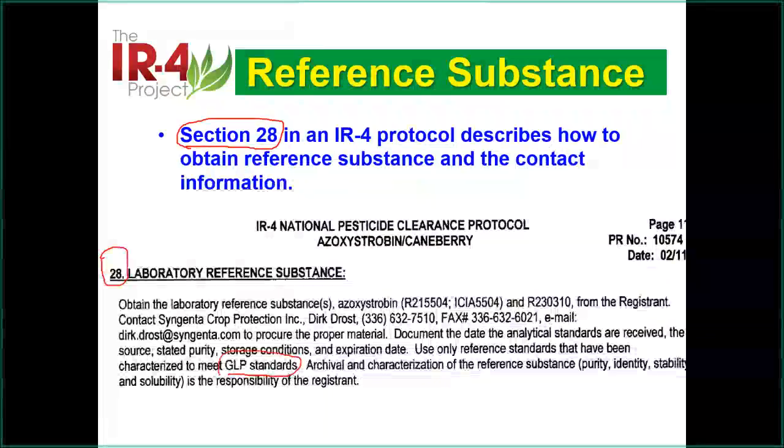If your standards are not GLP, you need to talk to the study director. Your work will not be acceptable. It depends on where your report is submitted to, but I would say you need to put up a stop sign there. We talked about this a lot yesterday.